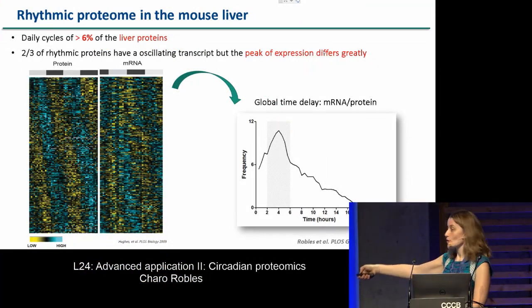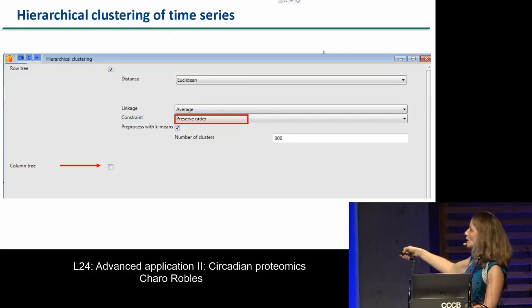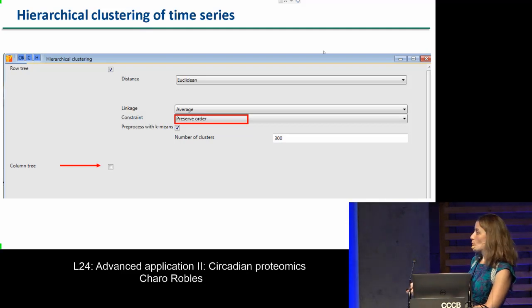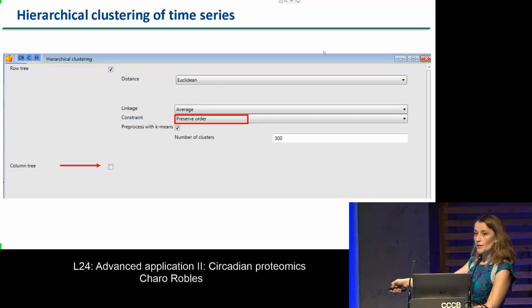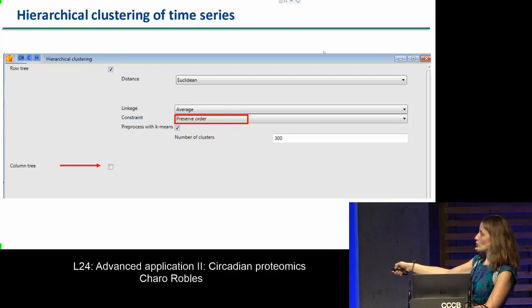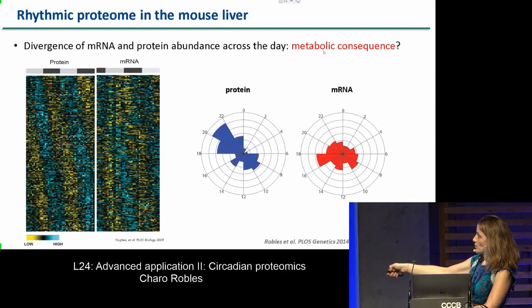To make this heat map in Perseus, you go to the hierarchical clustering button. The important thing is that you don't want to cluster the columns, because Perseus internally keeps the phase order from the cycling analysis. In the row tree, click 'preserve order' — preserve the order of the phase. You unclick the column tree and add 'preserve order,' and you get these nice heat maps organized by phase.